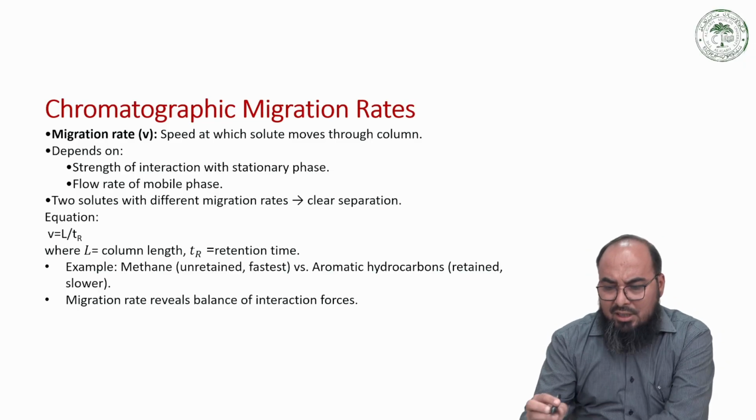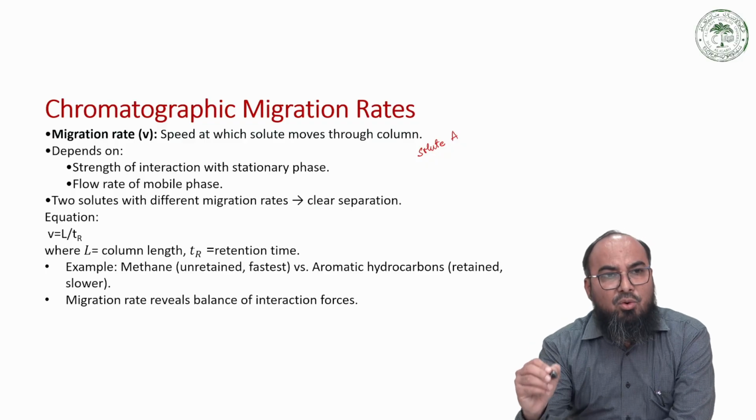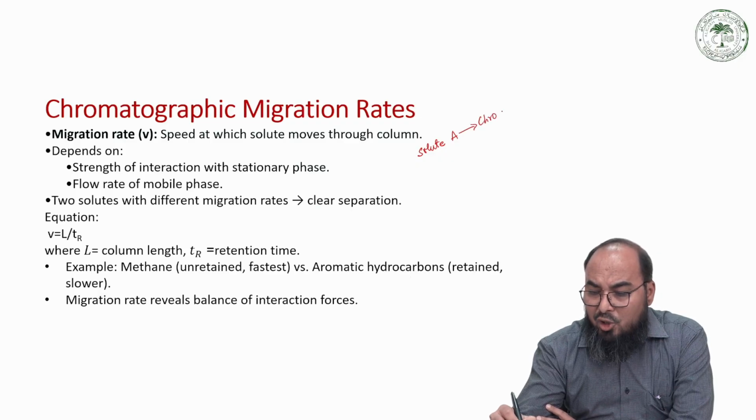Let us suppose we have a solute A. Then this solute A is being transferred when we apply the solute to any chromatographic column.